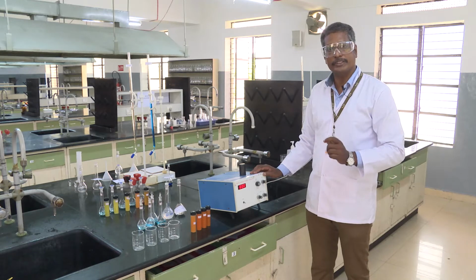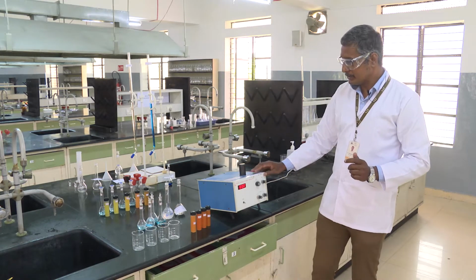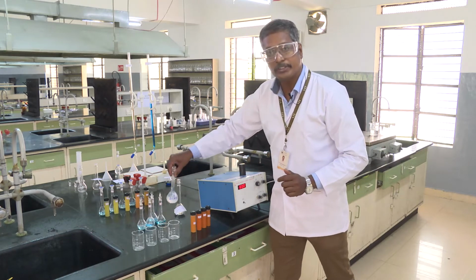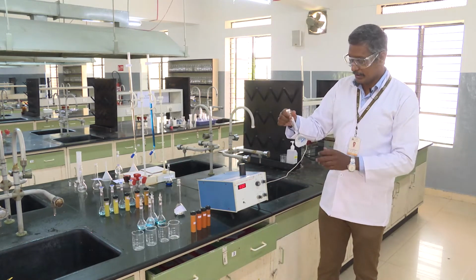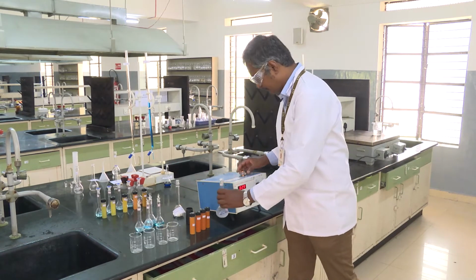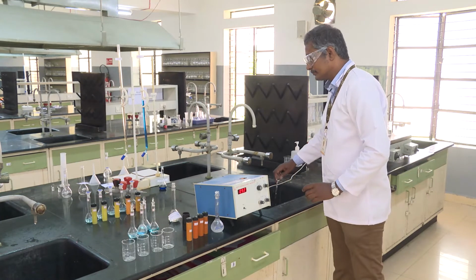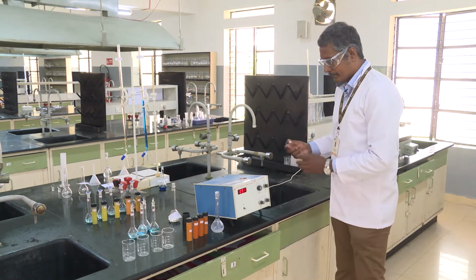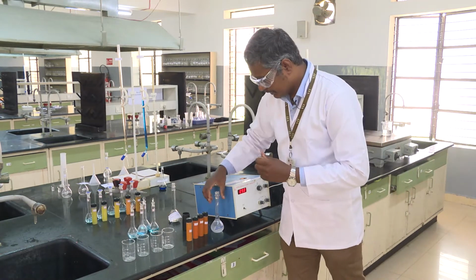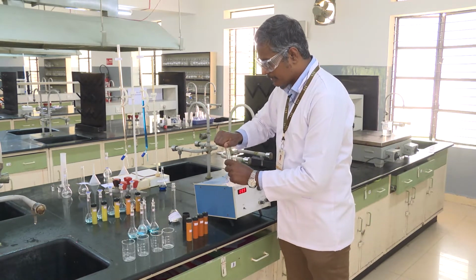So before using this instrument, we need to calibrate it by using a standard turbidity solution, that is 40 NTU. So let's take this standard solution to calibrate.